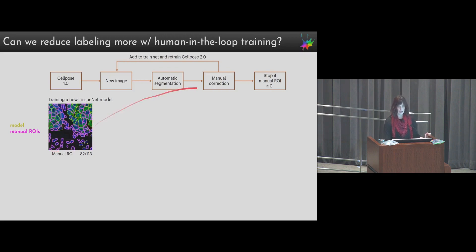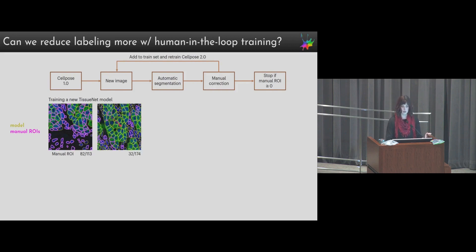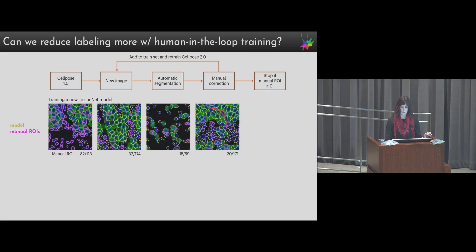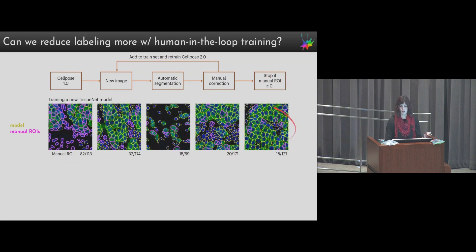After you do this manual correction, we retrain CellPose just on that one image, and things don't look so bad on the second image. When you run CellPose on the second image in your training folder, there aren't as many to correct — only 32 ROIs out of 174 need to be redrawn. Now we retrain the model iteratively: with two training images we again don't need to label too many, then with three images we label even fewer as a fraction, and once we've trained on four images there are very few corrections the user has to make.